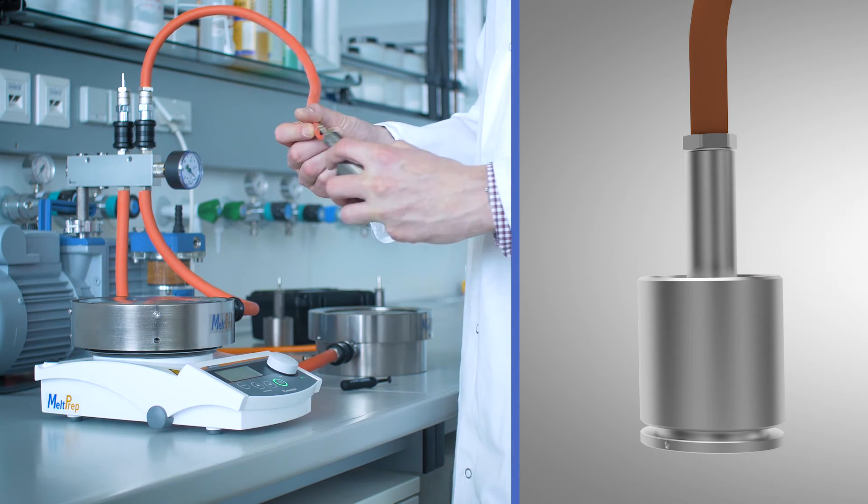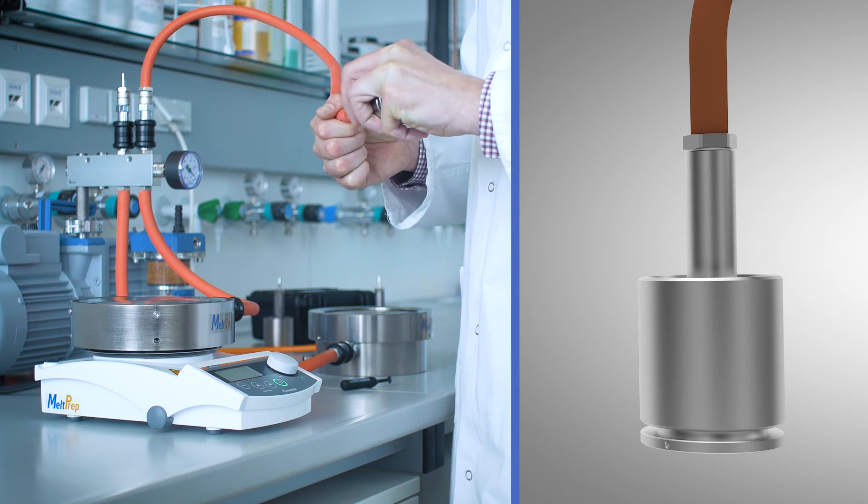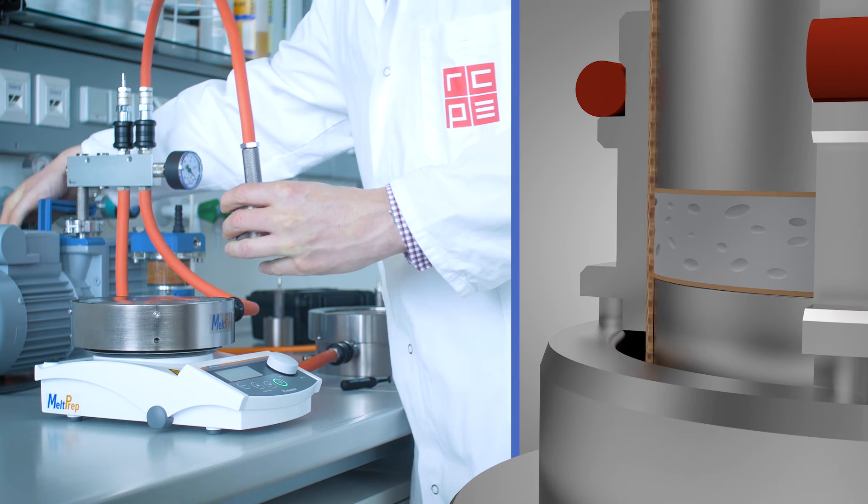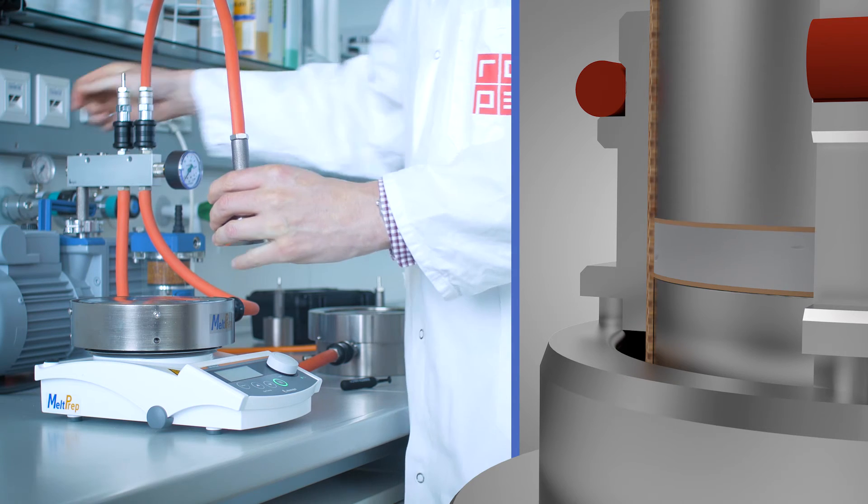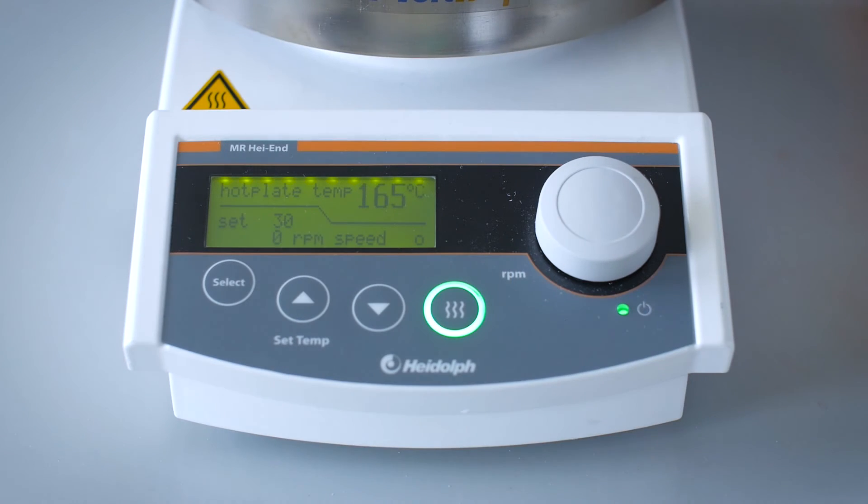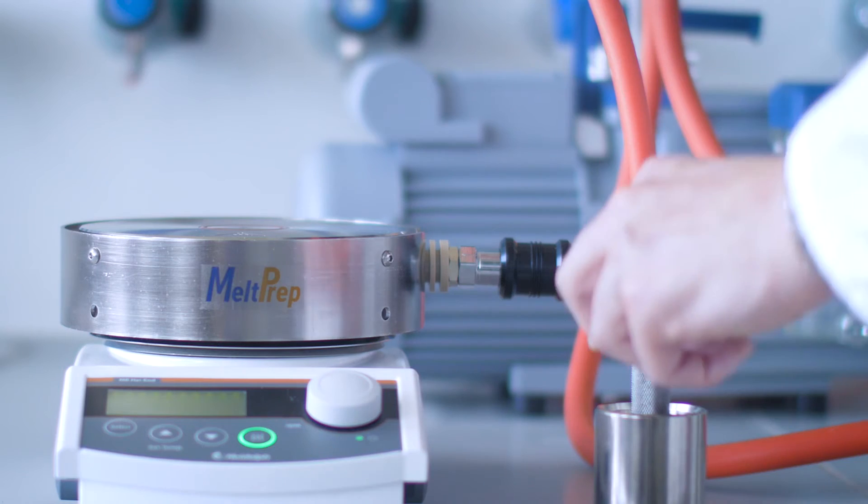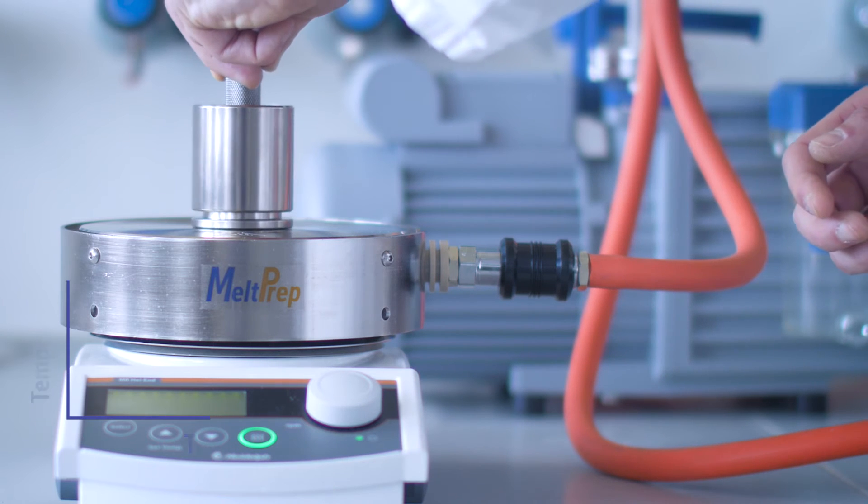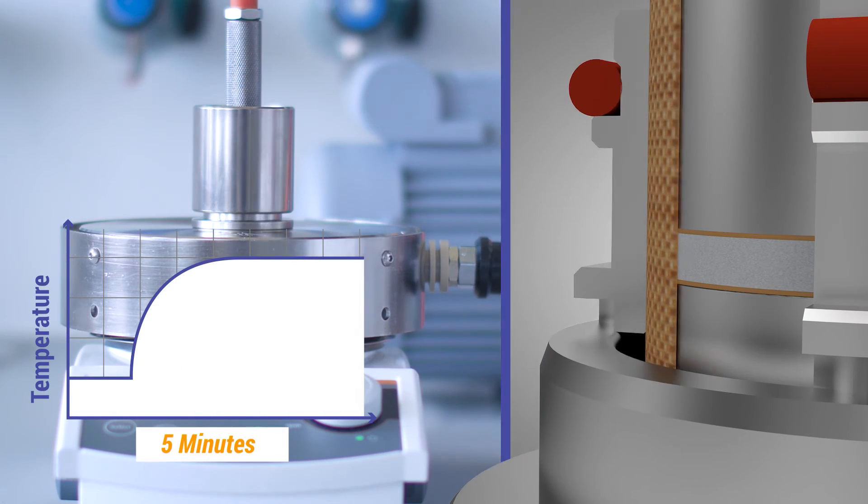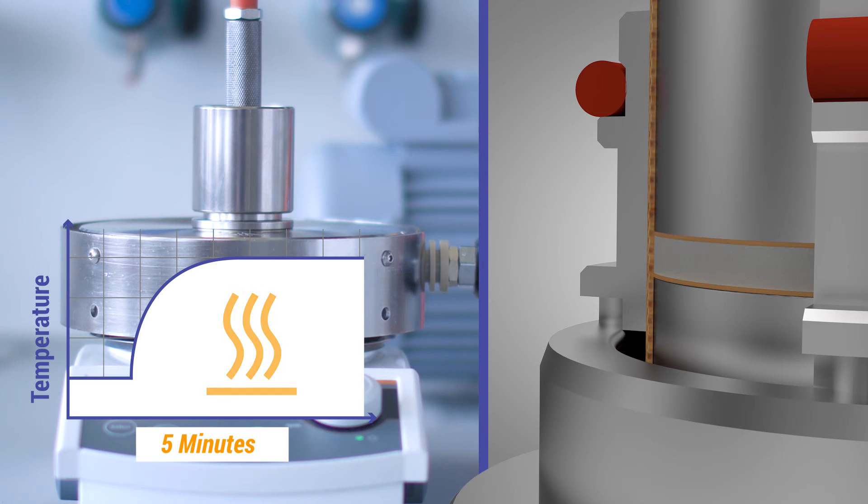We now apply vacuum to the chamber, building up a compressive force compacting the powder, while air, moisture and other volatiles are removed slowly. The sample is now ready to be molded and because we have such a small sample volume, that takes only about 5 minutes rather than the hour long melting time you would get with compression molding.